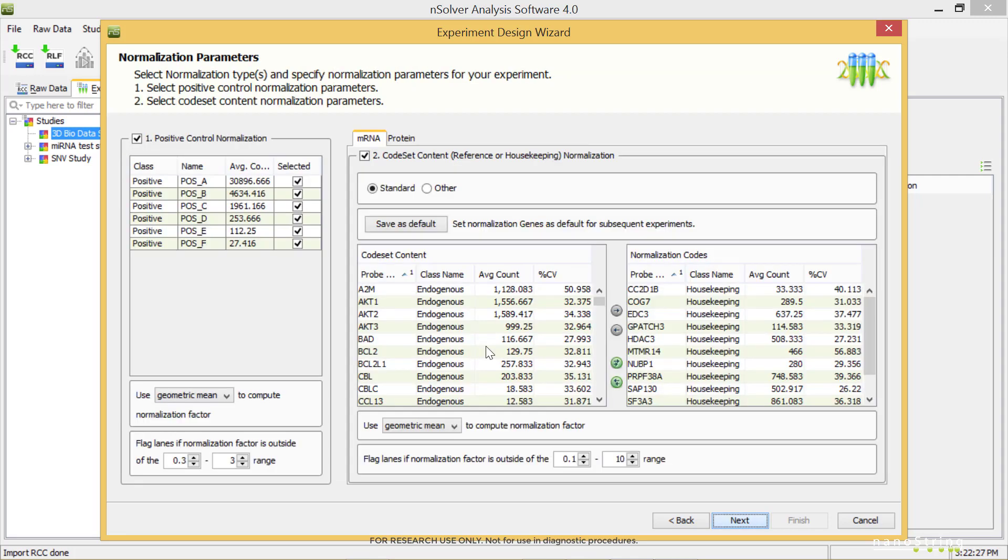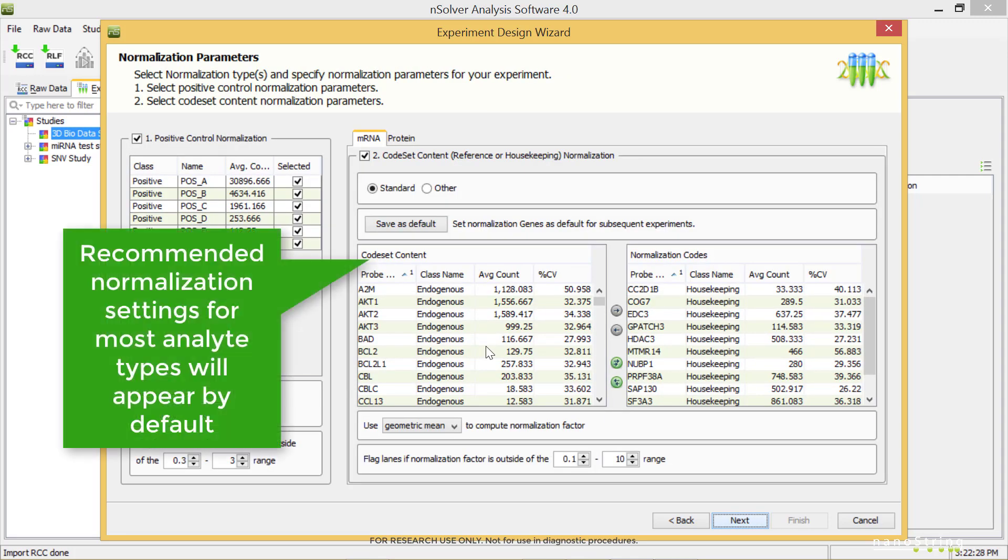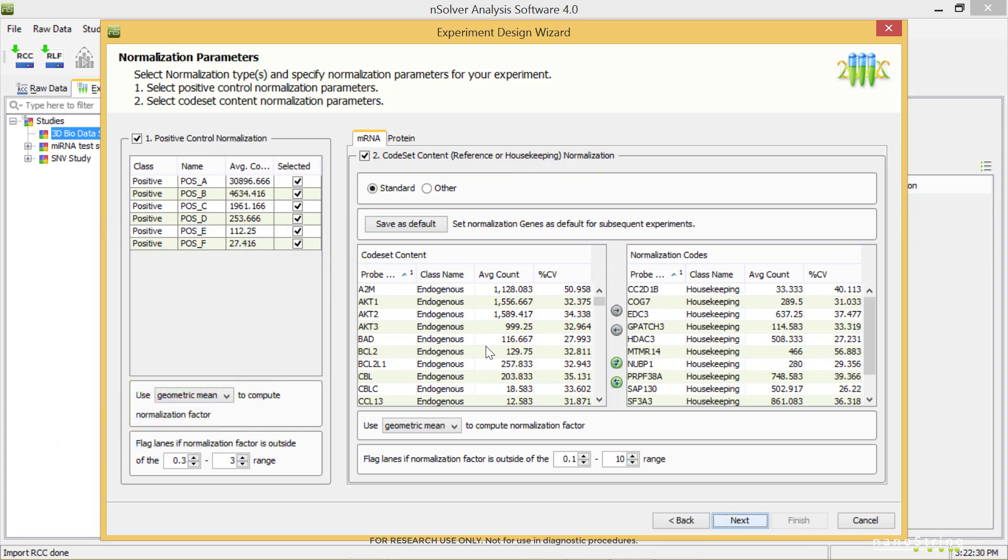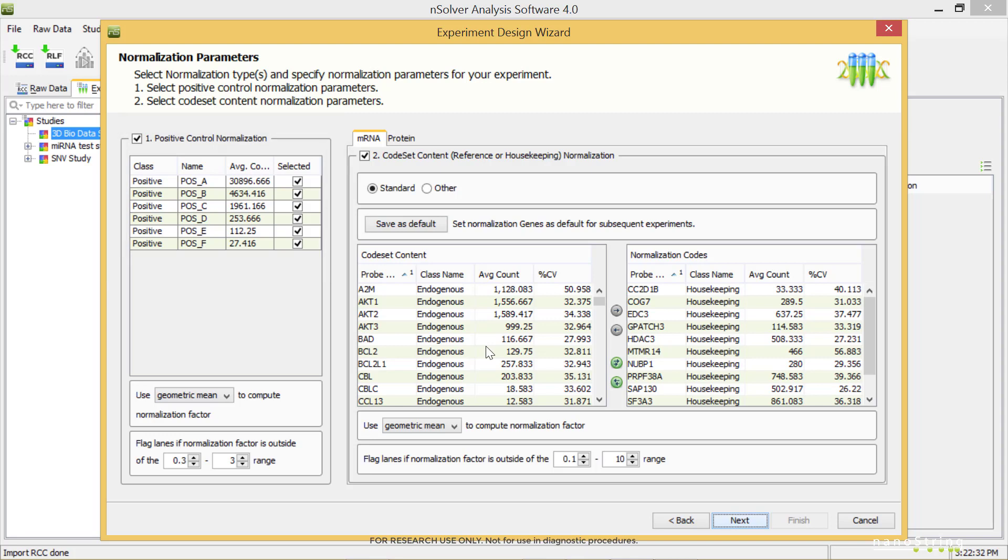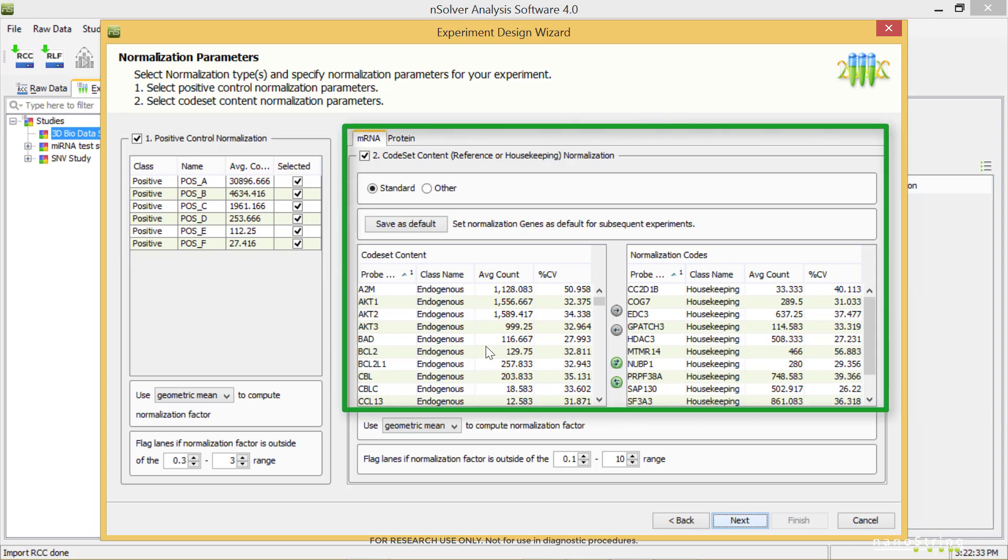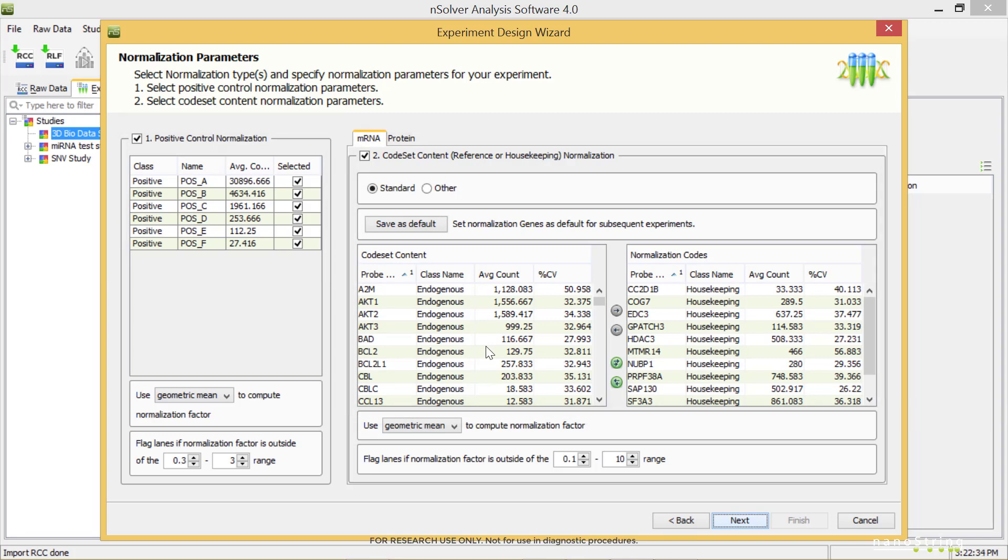Select Next. The recommended normalization settings for most analyte types will appear by default. Note that there is a positive control normalization field and a code set content normalization field. Use the tabs to review the settings for the different analyte types. Select Next.